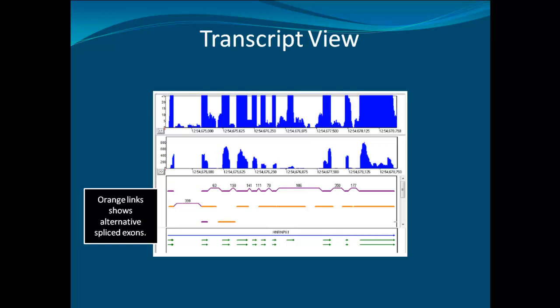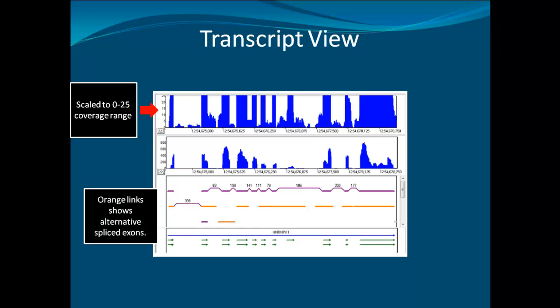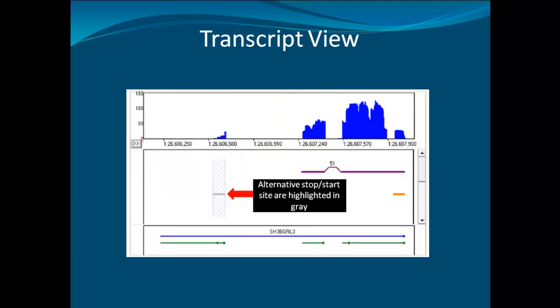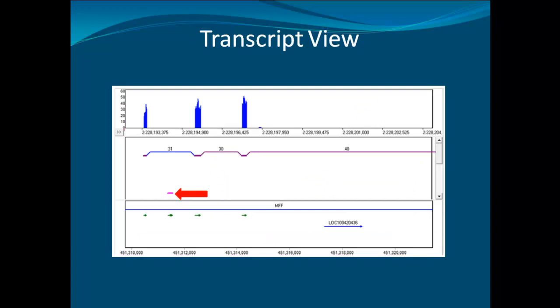The transcript view is a unique tool in NextGene that can be used for many purposes. In this example, the orange links show the alternatively spliced exons. The local coverage window is shown with automatic scaling and zoom into a range from 0 to 25 in order to see the low-level expression. In addition, the alternative stop and start sites are highlighted in gray for easy identification. For exon skipping, NextGene software uses a pink bar to indicate the position. In this example, the skipped exon is under the blue unannotated novel link.